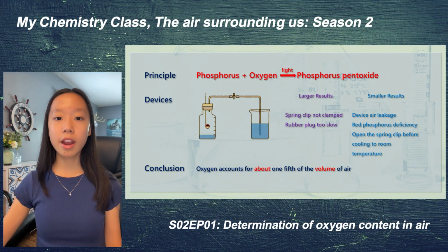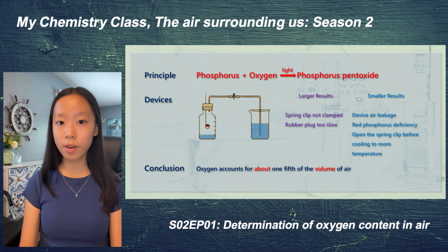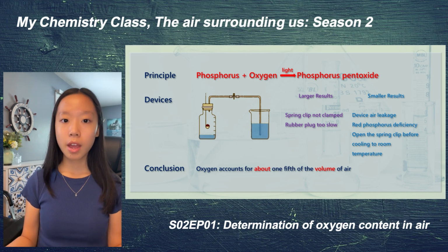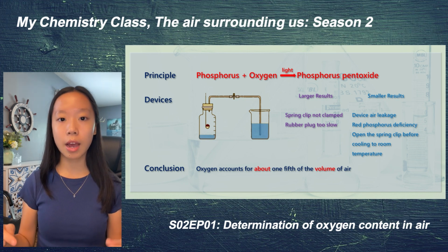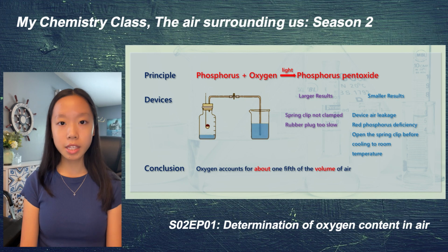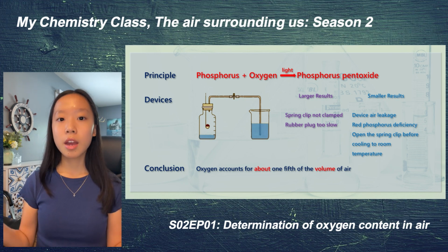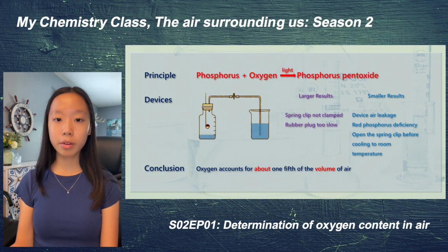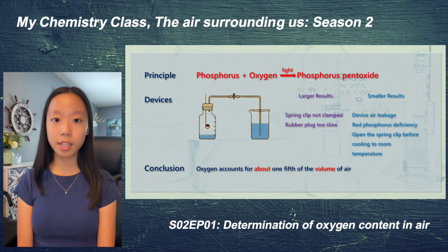So we all know that air is everywhere around us, it's surrounding us, and humans need air to be able to breathe and live. For example, if we're on the moon right now without any astronaut protection, then we wouldn't be able to breathe for much longer. And that's because there is a certain amount of oxygen in air that we will need every single day. And in this experiment, we're going to find out how much oxygen is in air exactly.